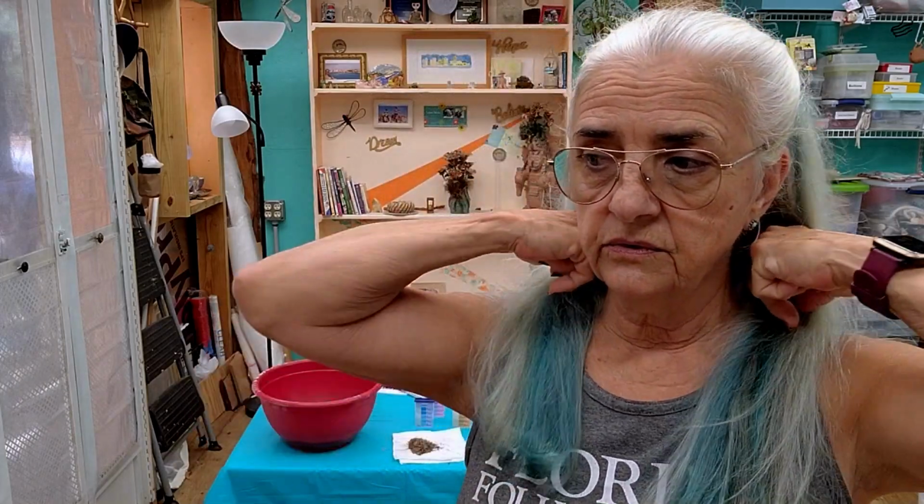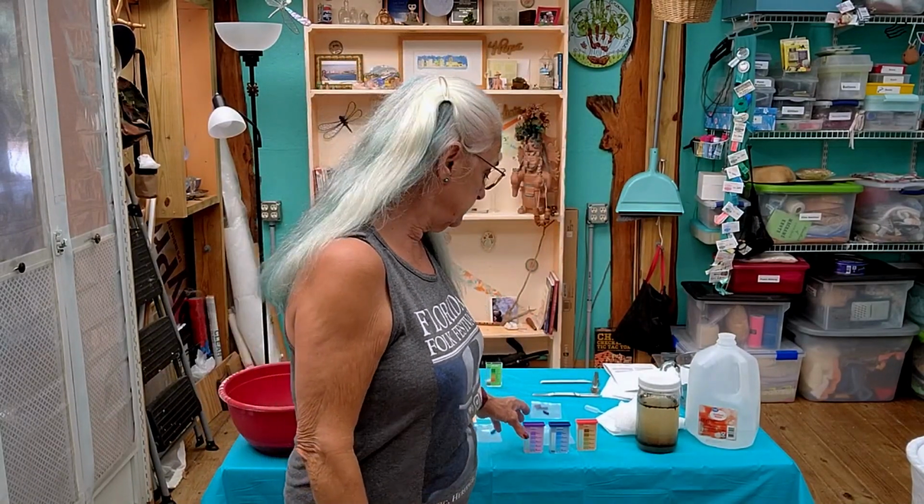And I had it set for 10 minutes. I'm going to let it go for 10 minutes, and then we'll come back. But that's your soil test kit, and we'll see how it goes and we can talk about that. Okay, it's been 10 minutes and I have the solution.